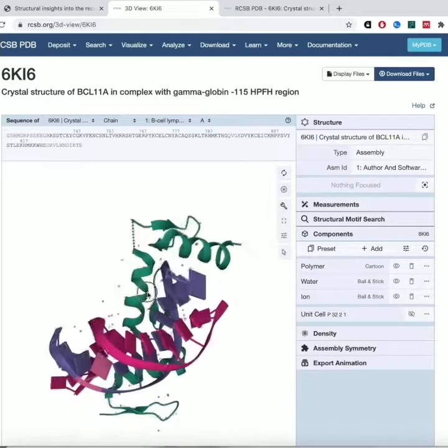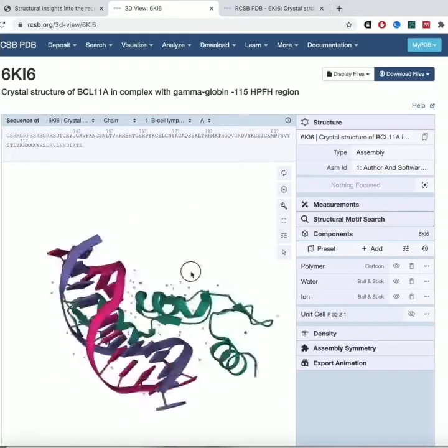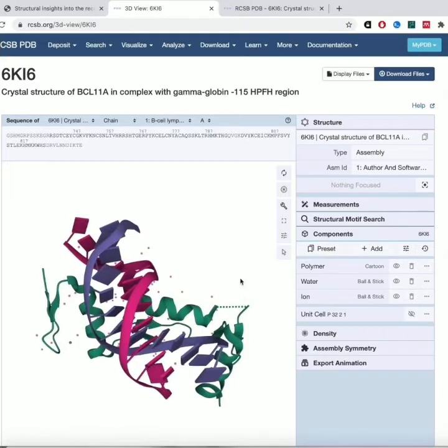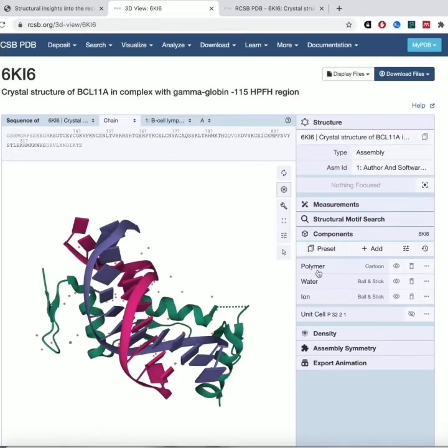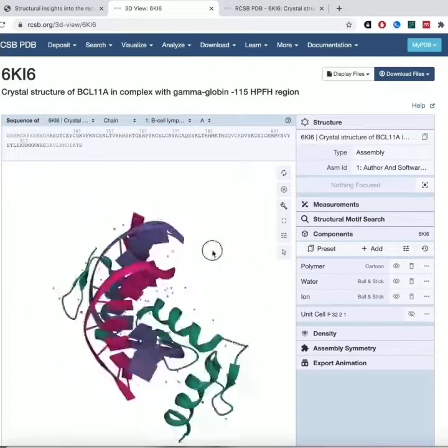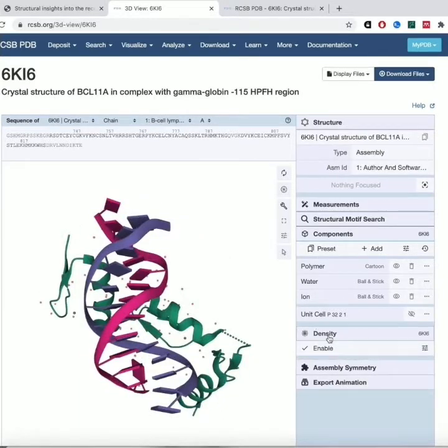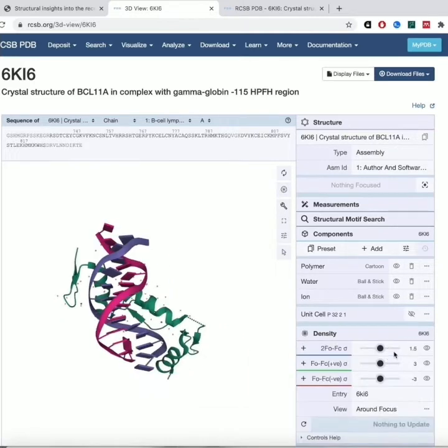You can see this dotted line — that's a region that is unmodeled. It was present in the protein but the structural data wasn't good enough, and so such regions are shaded gray in the sequence representation. There are a lot of different things you can do to play around and see various features, but right now I want to show you the density.